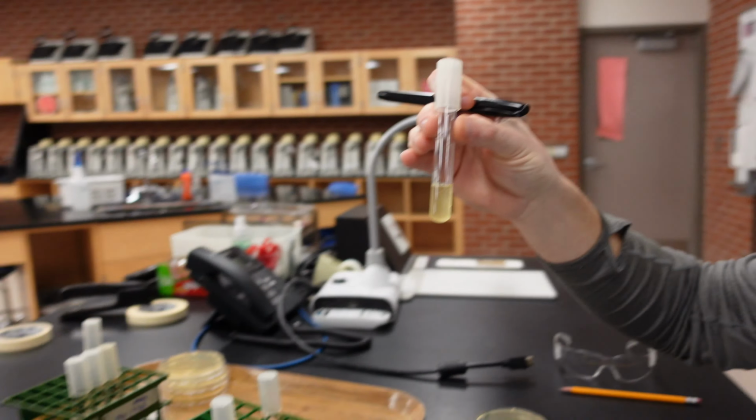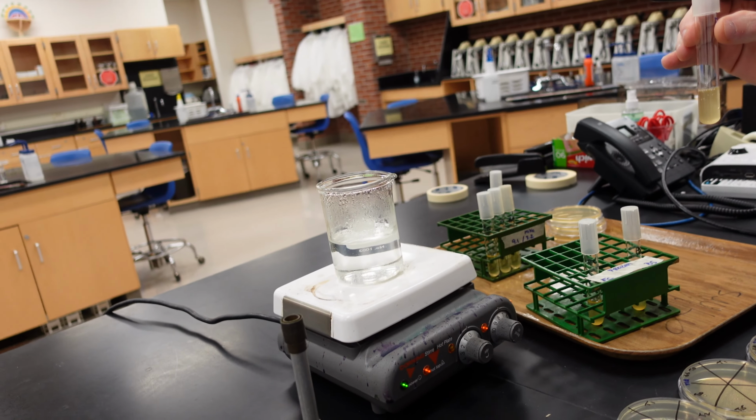So this is a pretty simple, straightforward lab. I'm simply going to be boiling test tubes of the bacteria by placing it into a water bath here and taking periodic samples. What we're testing for is the ability of the endospore to actually withstand the high temperature from the boiling water. So certain gram-positive bacteria will form endospores.